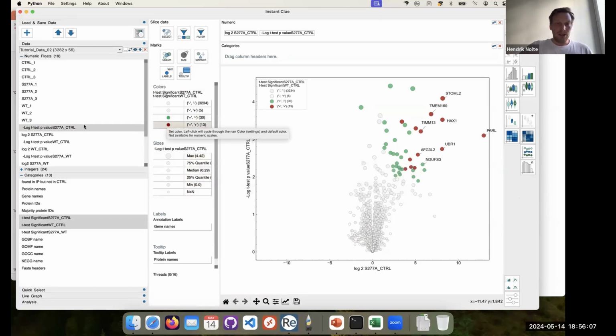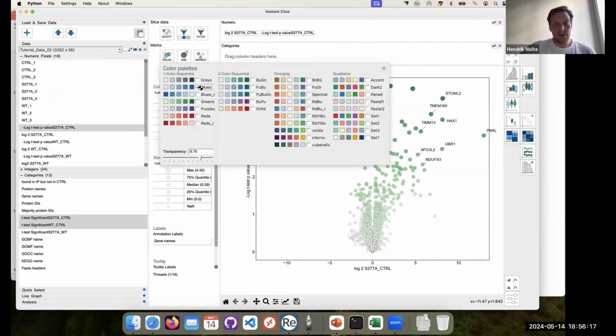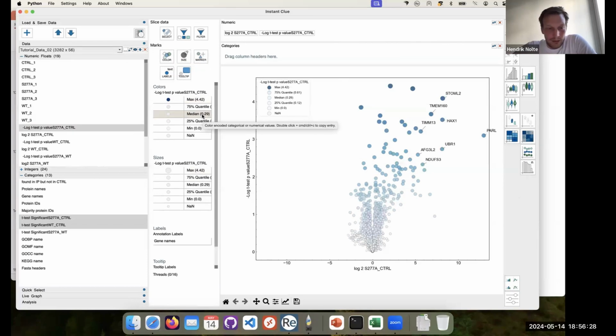And it's interesting to note that if we do that for color as well, then we cannot change the color, because then it's a fixed one, and we would have to change the color map upfront, and then it maps it to all. So there we are a bit limited in the range that the color covers.